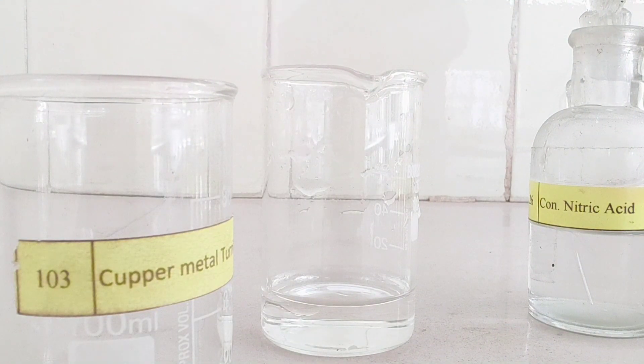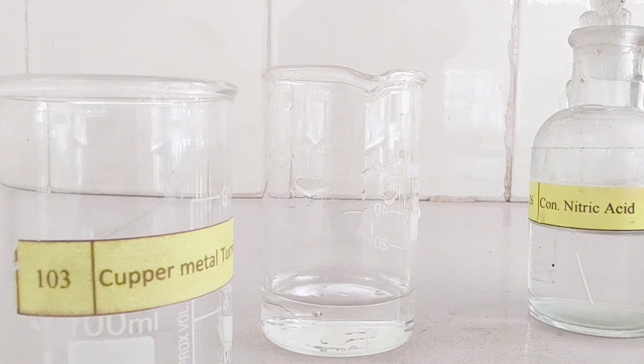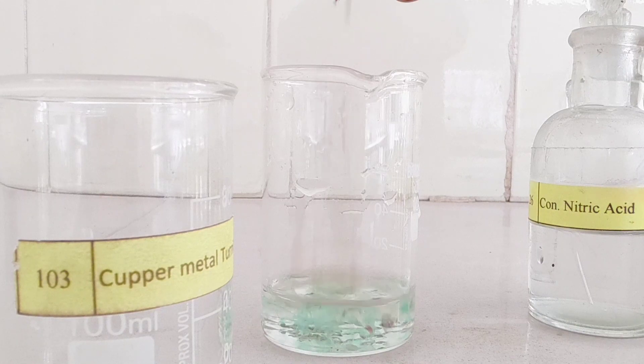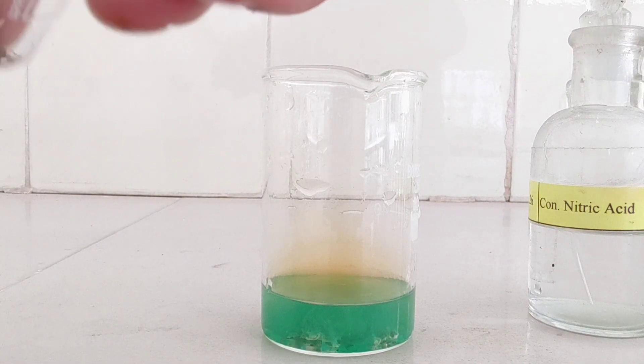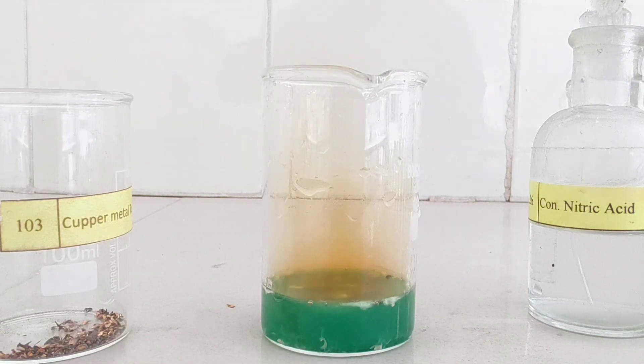And now we are finally going to start this reaction. Copper is oxidized by concentrated nitric acid, HNO3, to produce Cu2+ ions. The nitric acid is reduced to nitrogen dioxide, a poisonous brown gas with an irritating odor.